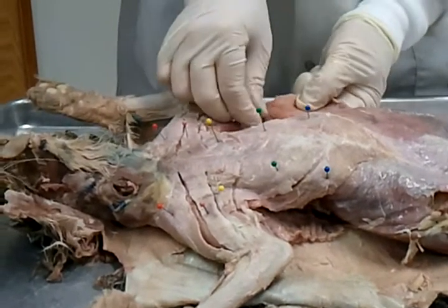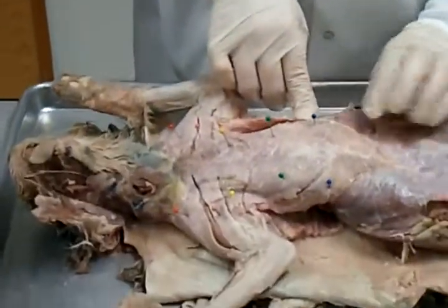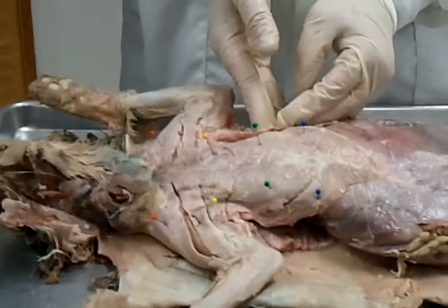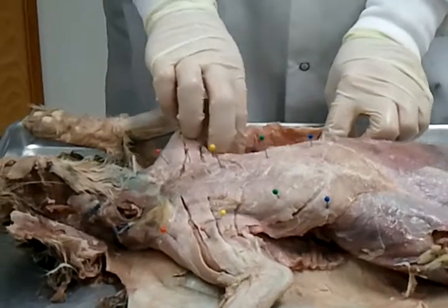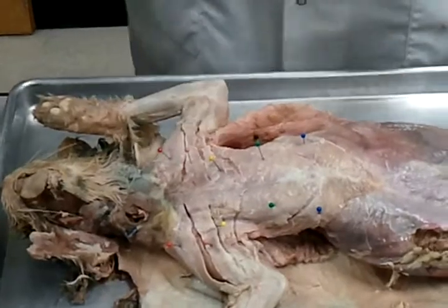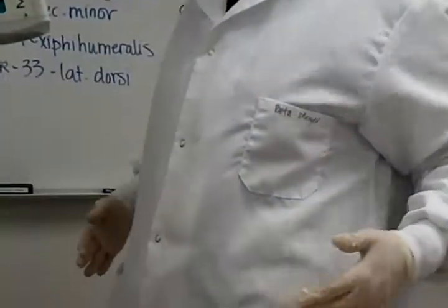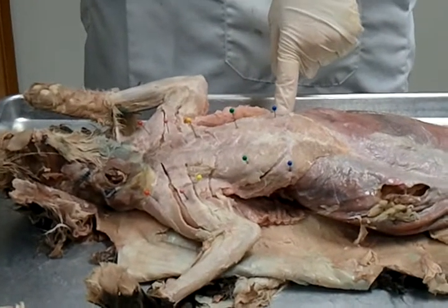So what this looked like before it was dissected was these muscles were all close together, and you'll see that on your cats. It'll be all closed up in here, and these will be close together because that's normally how the cat works. This muscle back here, see how it comes into the back of the arm, the shoulder, and goes on the back? The latissimus, to the side, dorsi. And it's actually pulling the shoulder back, because the shoulder gets pulled a lot of ways. So this is number 33, the latissimus dorsi.